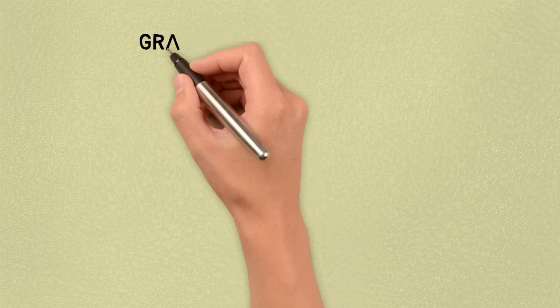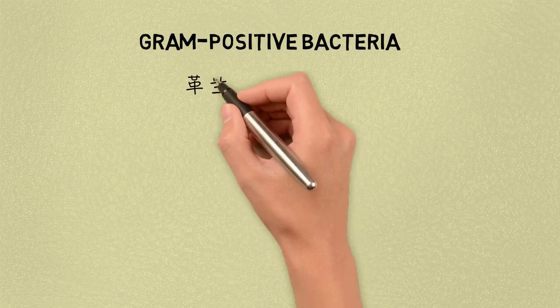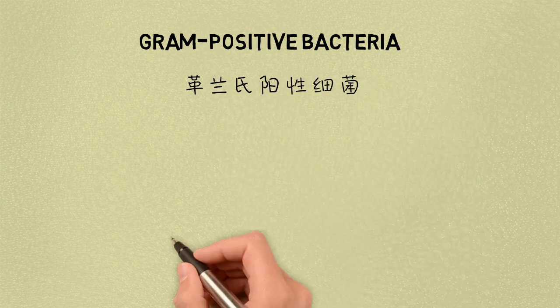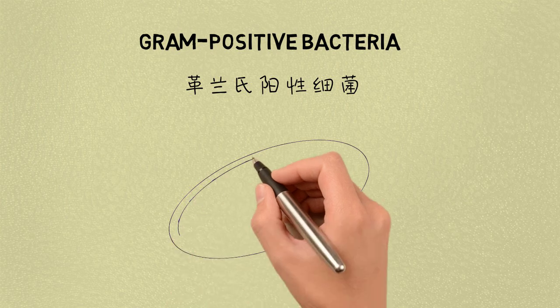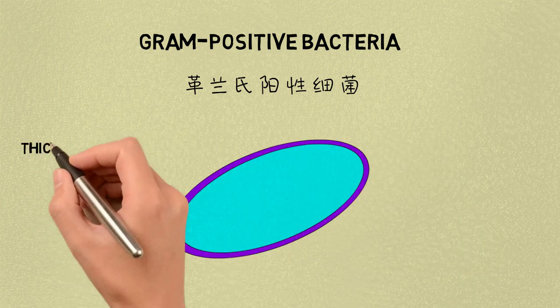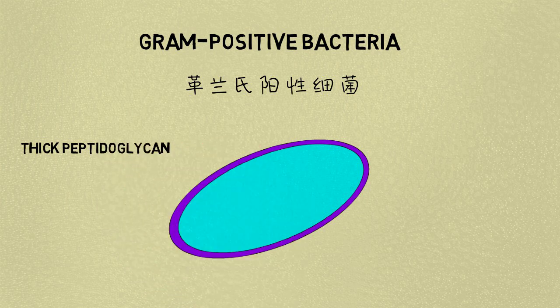Gram-positive bacteria. Gram-positive bacteria generally have a single membrane, monoderm, surrounded by a thick peptidoglycan. Some bacteria have cell walls which are particularly adept at retaining stains. These will appear positive by gram stain even though they are not closely related to other gram-positive bacteria.